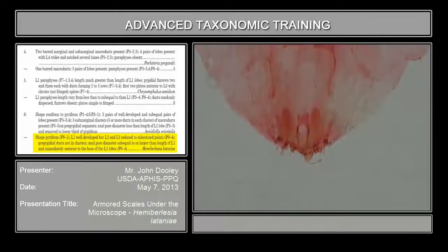There are no clusters, so you won't confuse this with Aonidiella anyway, because you can see all three lobes on Aonidiella pretty well — they're pretty well formed and they all look pretty much the same shape. But with this species there are no prepygidial ducts in clusters and the L2 and L3 are reduced.